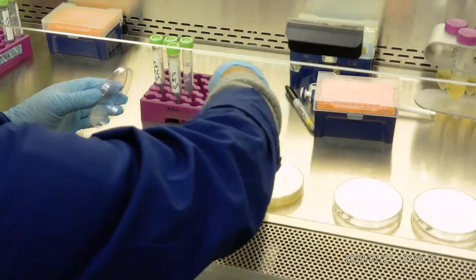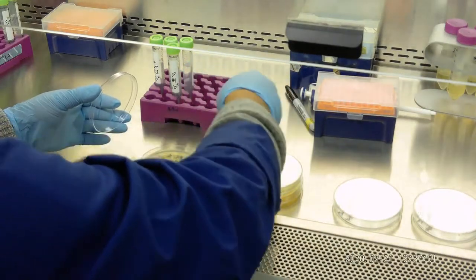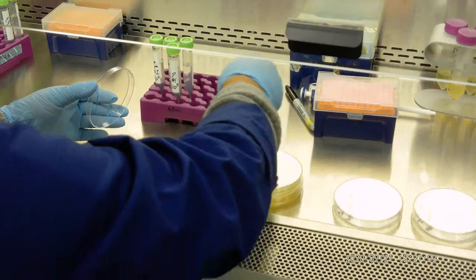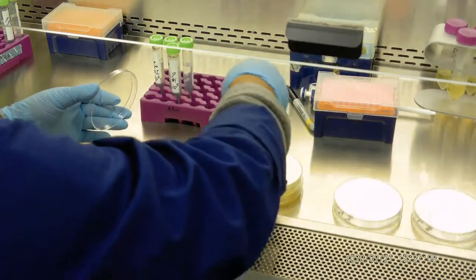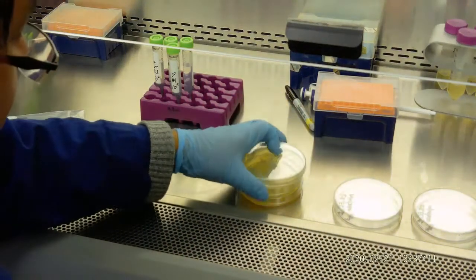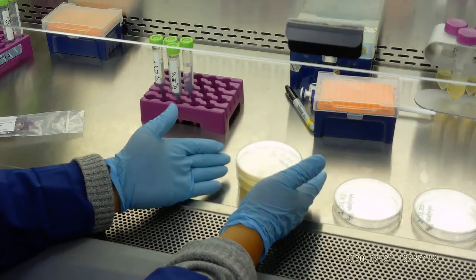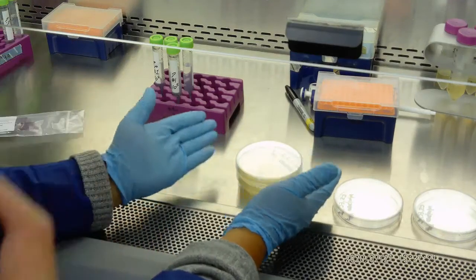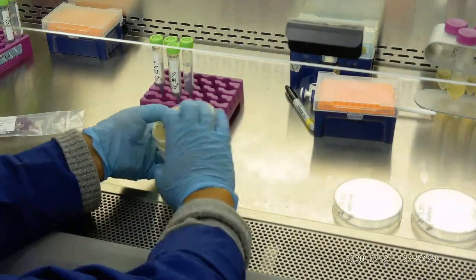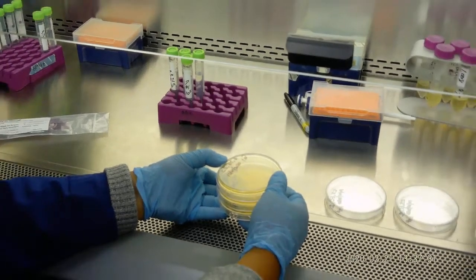So go here. Okay, then you go here. Okay, now it's finished. We will leave it like this for a little bit of time, maybe take a picture. We stack it a little bit, maybe about 3 to 5 minutes, then we flip it over. Always make sure you flip it over, then you go to the incubation. So always remember you do like that, then you go to the incubation.